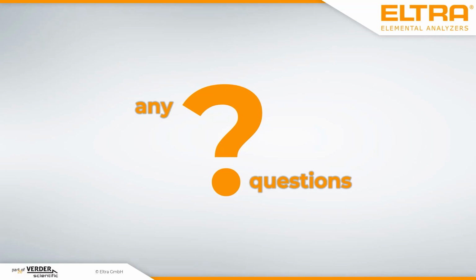Nevertheless, there's the request for such a metal tip, which lasts a little bit longer and has to be replaced less often. At the moment, we are testing it, and then we can give you feedback. But this is something which can be developed in the next weeks and months, because it's just a tool which can be replaced very easily. Yes, and these are the common questions for this kind of autoloader.